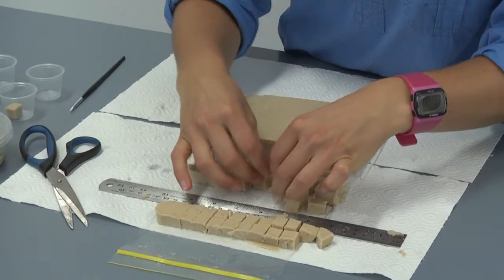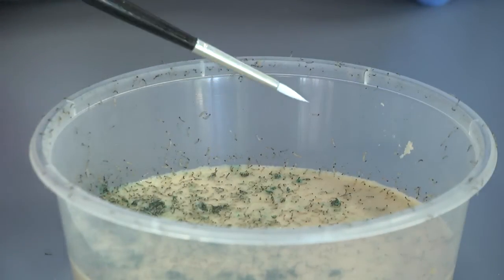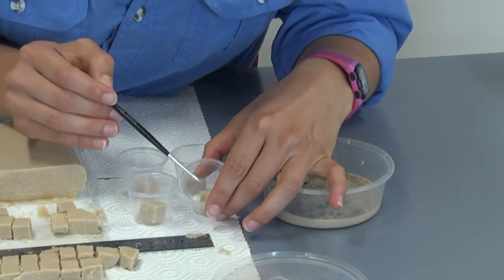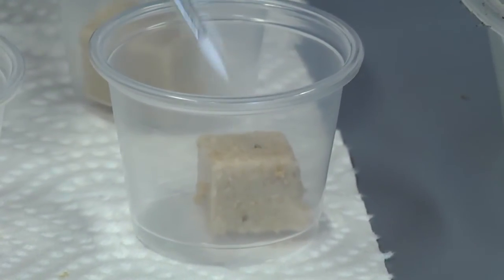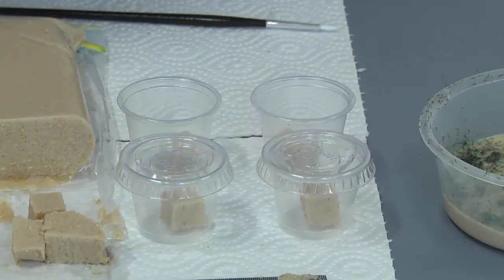Once you have your diet cut, take your rearing cups and place one cube of diet into each cup. Next, take your container of neonates or eggs. To pick up a neonate, place it on the very tip of your paintbrush, bring it over to your cup with the diet in it, and gently place the larva onto the diet by twisting the paintbrush.